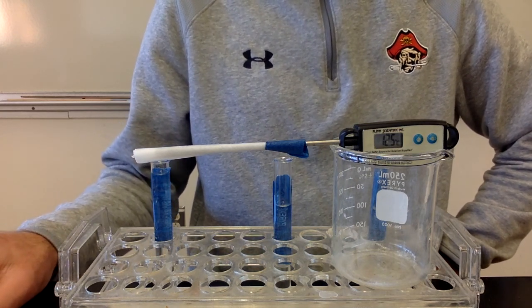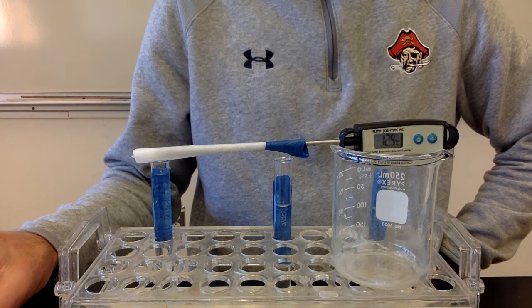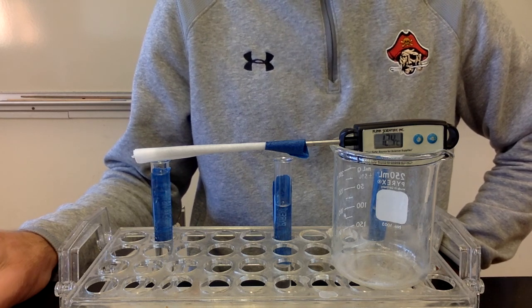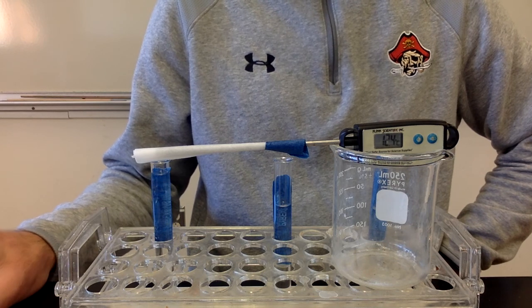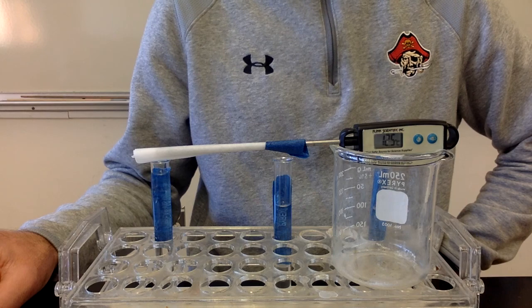All right, so that's probably good for the water. You can stop collecting data, and then we're going to continue with the other two liquids, and we'll be able to compare how easily they evaporated, how quickly they evaporated, and how low the temperature gets.